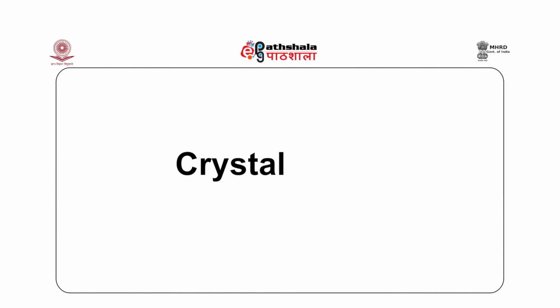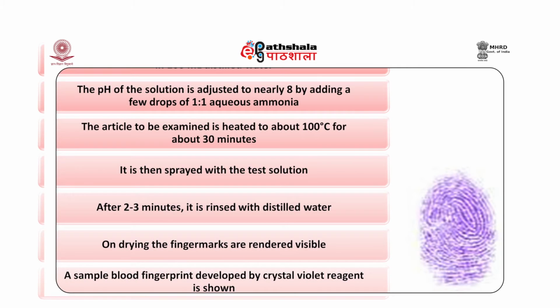Then another reagent is crystal violet. The working solution is prepared by dissolving 0.1 gram crystal violet in 100 ml distilled water.